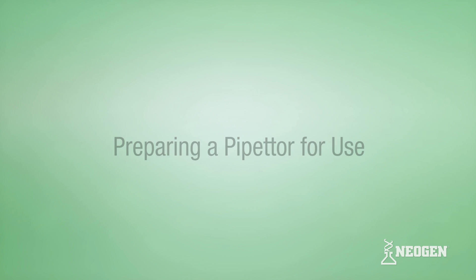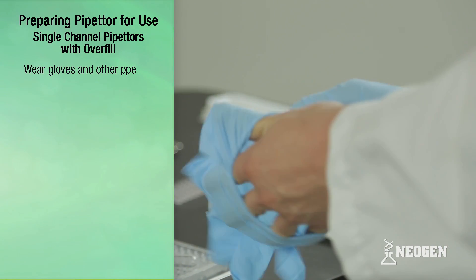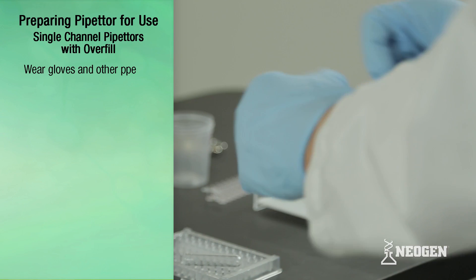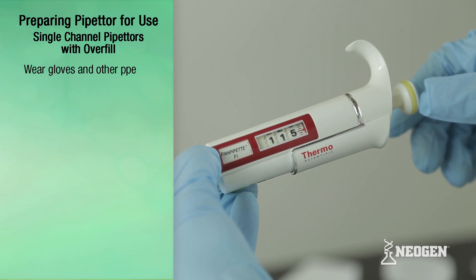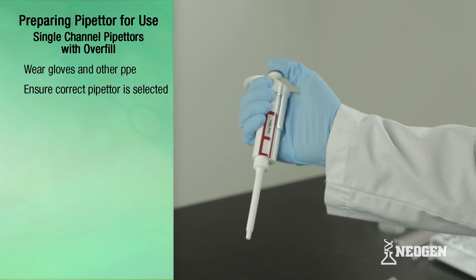Preparing a pipetter for use. It is a good idea to wear gloves and other personal protective equipment in accordance with your company policy. Before using a pipetter, it is critical to ensure the correct pipetter or volume setting is selected.